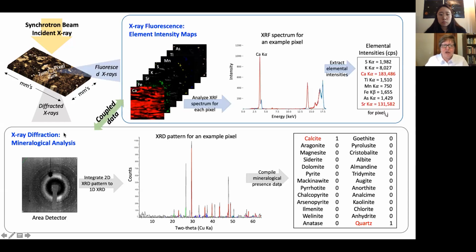Our approach is to train a machine learning algorithm using coupled XRF-XRD data, and then solely use XRF data to map minerals at the millimeter scale. The principle behind this is that fluorescence is sensitive to individual elements as well as to local density variations. Therefore, embedded in the XRF data is the information about mineral phases. By training a machine learning algorithm on a data set of coupled XRF-XRD, we are providing a way for the XRF data to reveal what it already knows, mineral identification. This is an important point, as this is not just a statistical application of machine learning, it is one based on physics.